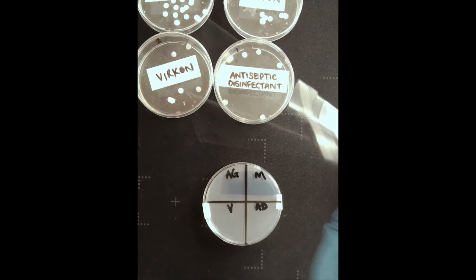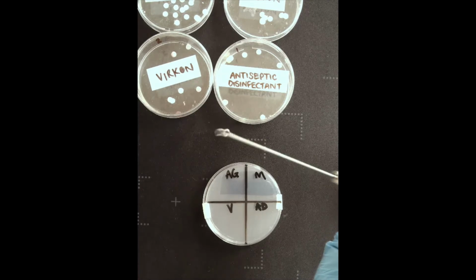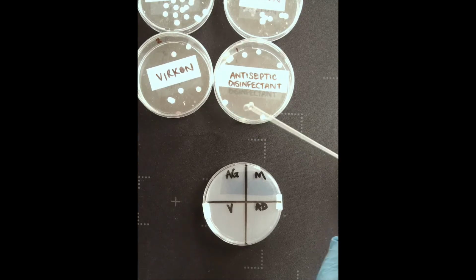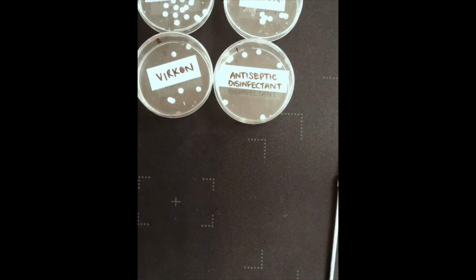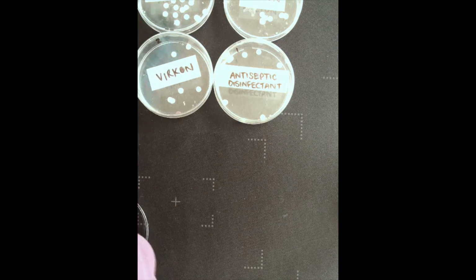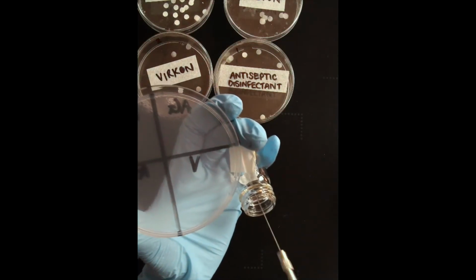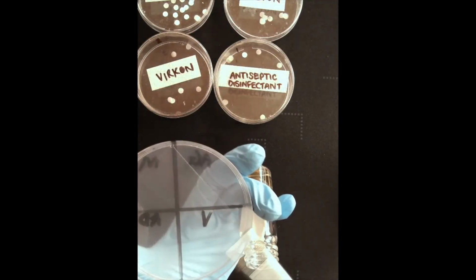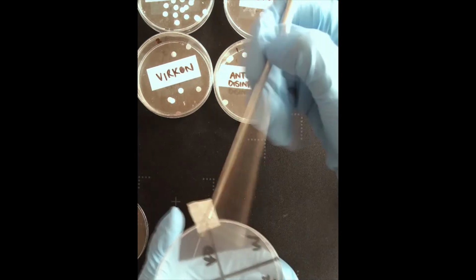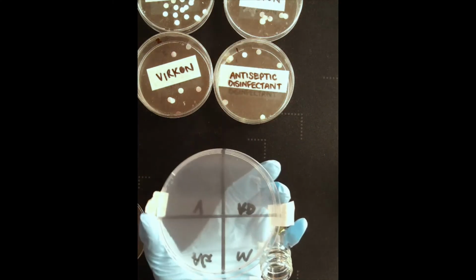And because I am using an inoculating loop, I'm going to make sure I sterilize it as well. So at the side, I have got a Bunsen burner on. And every time I transfer the bacteria onto the agar jelly, I am going to pass it through the hot flame. I'm just going to heat my inoculating loop to sterilize it. Wait a few seconds to cool it down so I don't burn the agar jelly. And then just put it into the bacteria and lightly spread it. To ensure there's an even spread of bacteria, I'm turning the Petri dish around so that I can spread the bacteria.